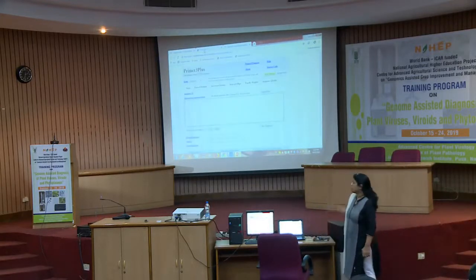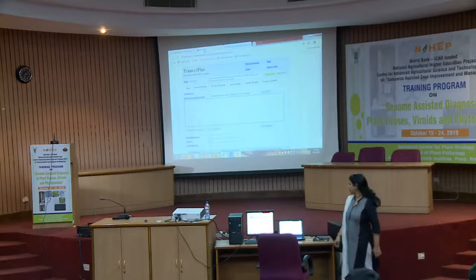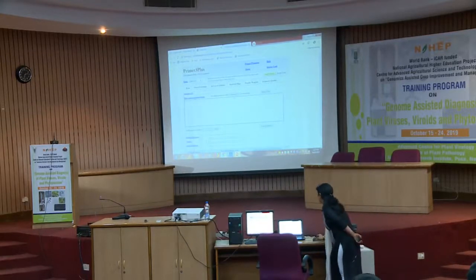Okay, so this is the window. Let's suppose I pick any of the sequence.